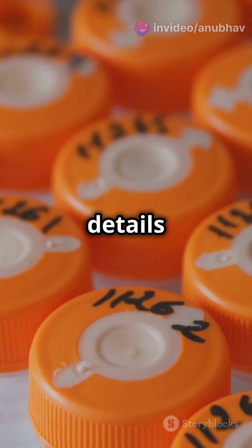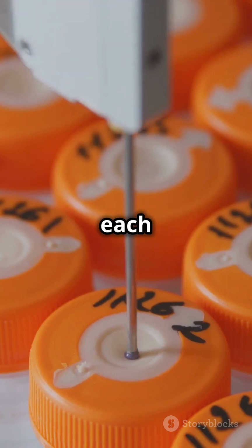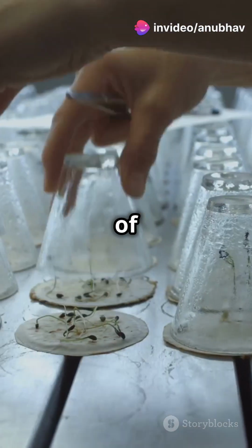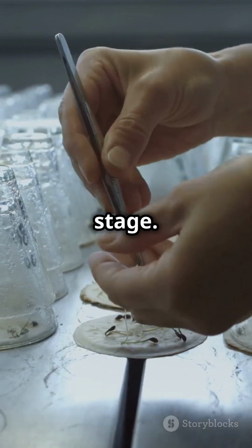Make sure it includes details like the sample ID, which is a unique identifier for each sample, date, and time of transfer, which helps in tracking the sample's journey, and the names of the handlers. This ensures accountability at every stage.